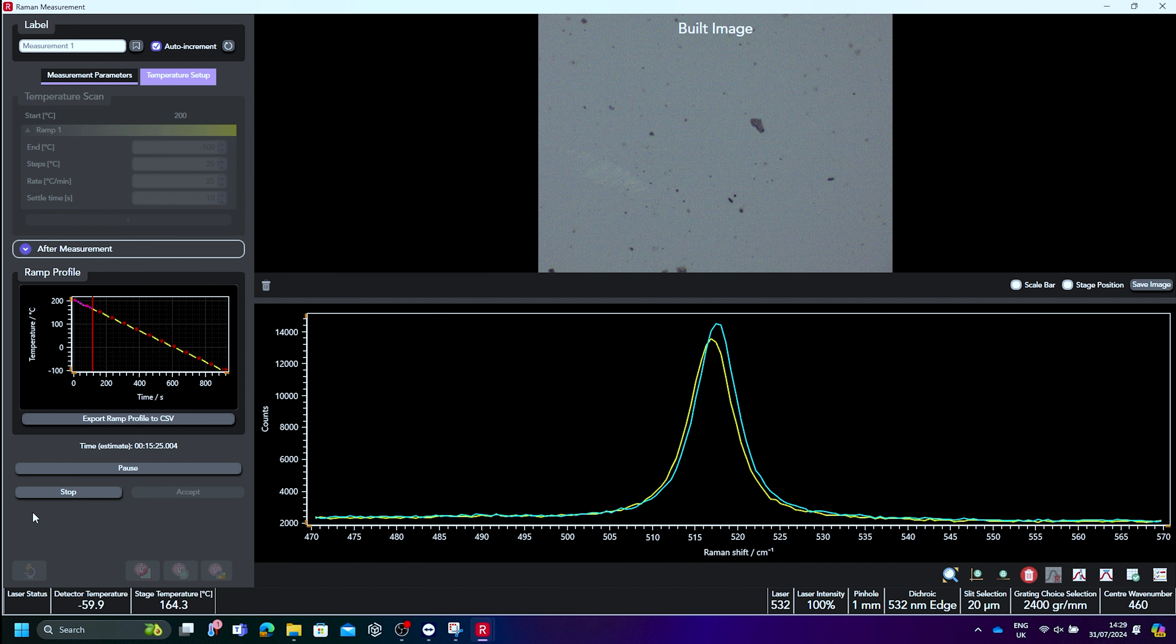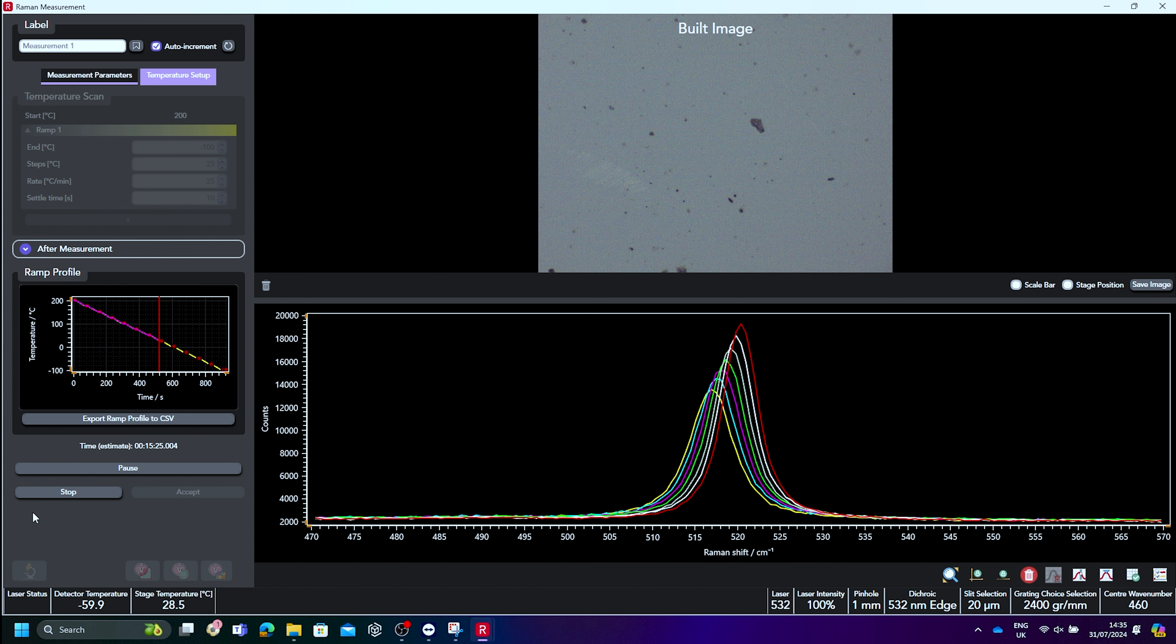As the scan progresses, the Raman shift position of the prominent silicon phonon mode increases as the temperature decreases, and the full width half maximum decreases, both of which are consistent with literature reports for the material.